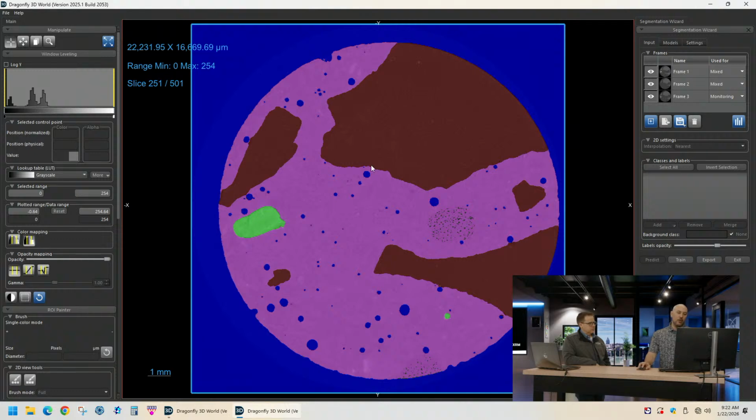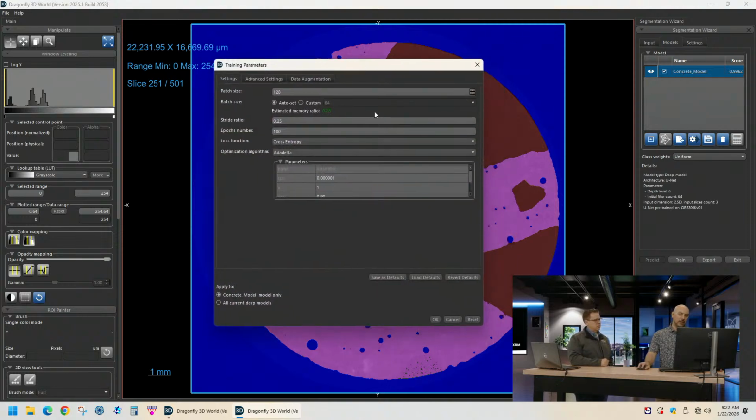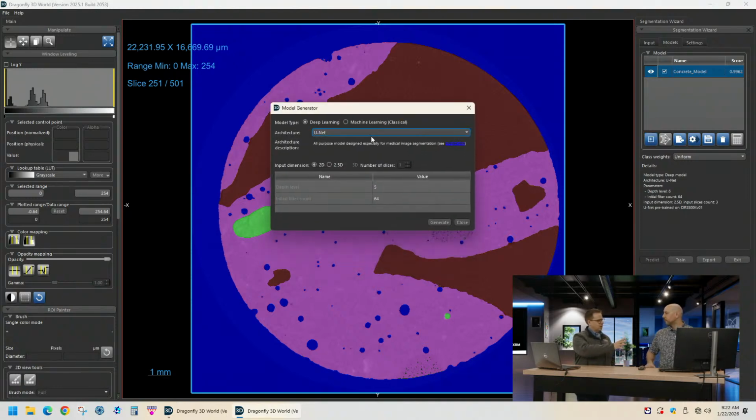All right. And if you were to open it to begin with, you just wouldn't see those frames you already have in there, and you wouldn't have the model loaded. Right. It would prompt you for a model. So it would prompt you to create a model. Yep. So then basically what we're looking at here, let me do this. So let's say we wanted to. Yeah, if you're starting new, right? What does this mean? Model. What is the model? What does that mean?